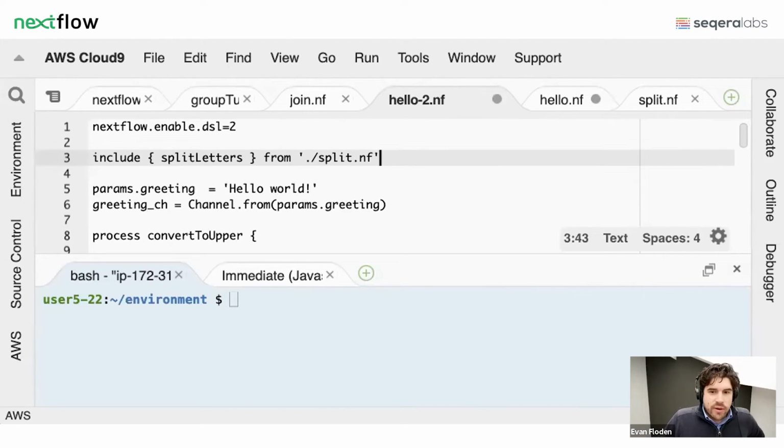I think it's best now if we want to see the power of this, and how it's used in a production setting, and why this is so important. I'm going to pass it over to Harshil, who's going to give us a quick demo of what it looks like for NF Core, and what it looks like when you can create pipelines that have many different steps, where each of those steps can be modularized and split up, and really the community effort to build out modules using this approach. So I'll pass it over to you, Harshil, and you can give a demo of what that looks like.